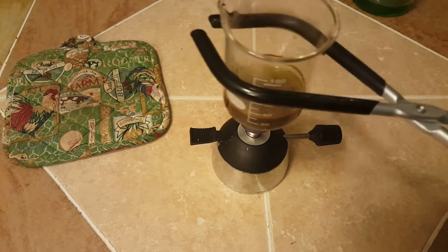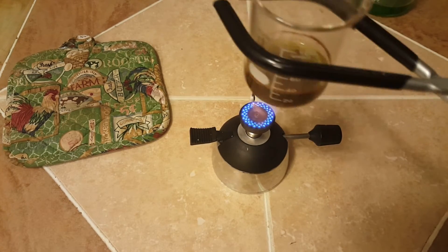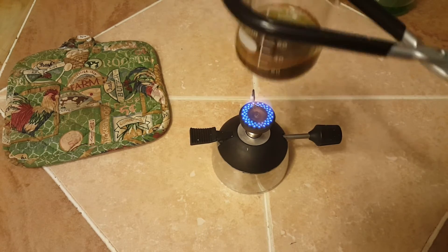After about 15 to 20 minutes of low heating you can see that most of the solution has taken on this dark red to brown color. This is our Chevreul's salt.